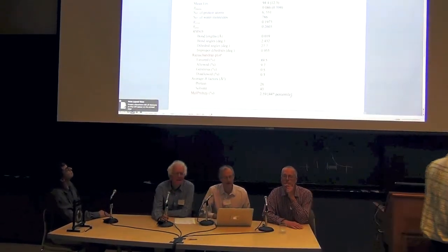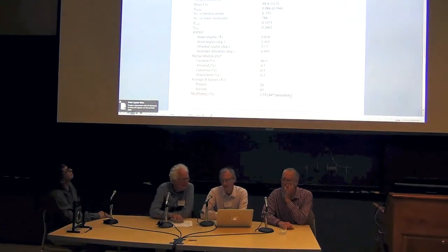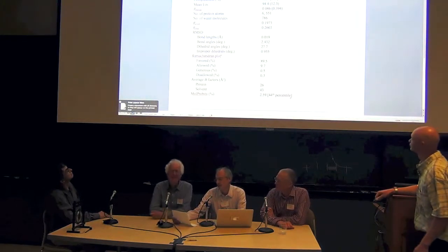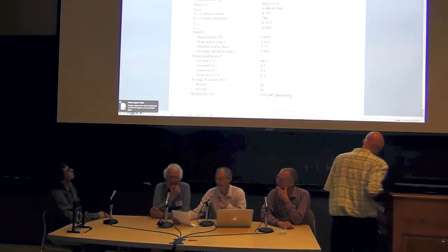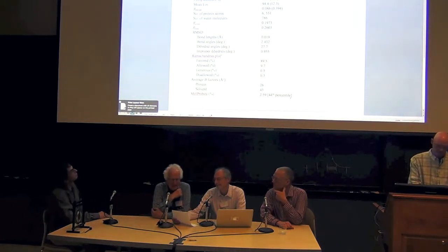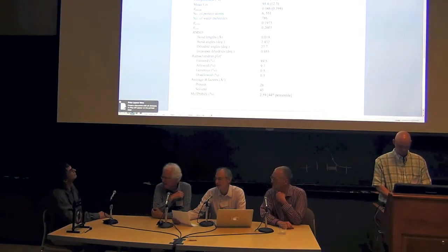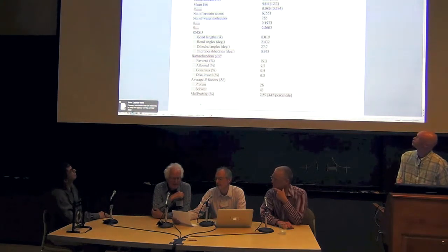Well, I'm happy to start, actually. This is first up publication, right? So the various programs will produce a Table 1, and as you can see from the display up here, it does show the resolution, overall. The multiplicity is here, the completeness is here, the average I over sigma is here, and so on. I was mostly concerned with the early stuff here.